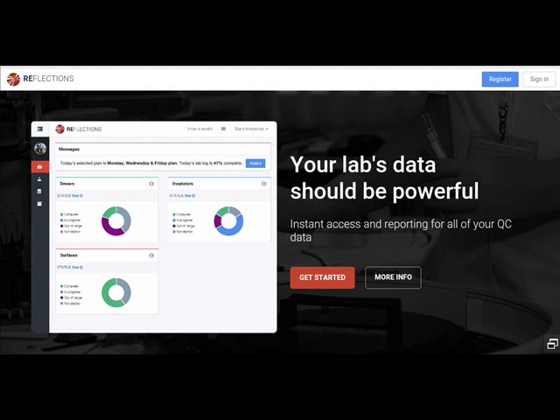Hello, I'd like to tell you about a nice little app that's ideal for data collection with QC work. It's called Reflections by Althea, and I'm using it in my lab for about a month or so now. The Reflections app is part of a series of apps all designed for the laboratory, and it's developed for general labs as well as for IVF, and it's proving to be a very flexible application indeed.